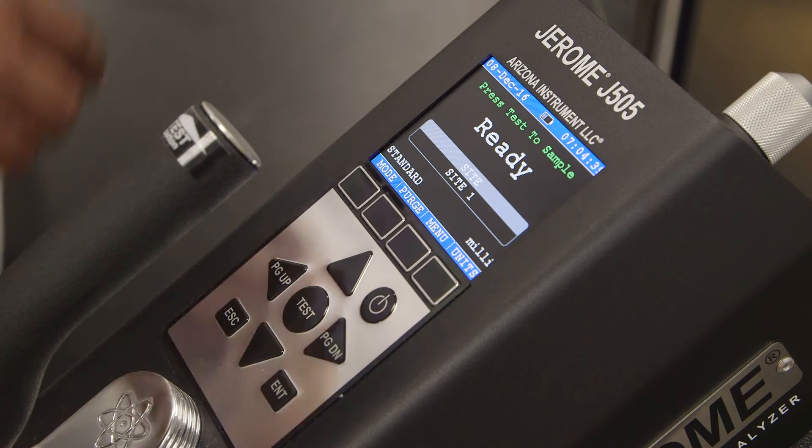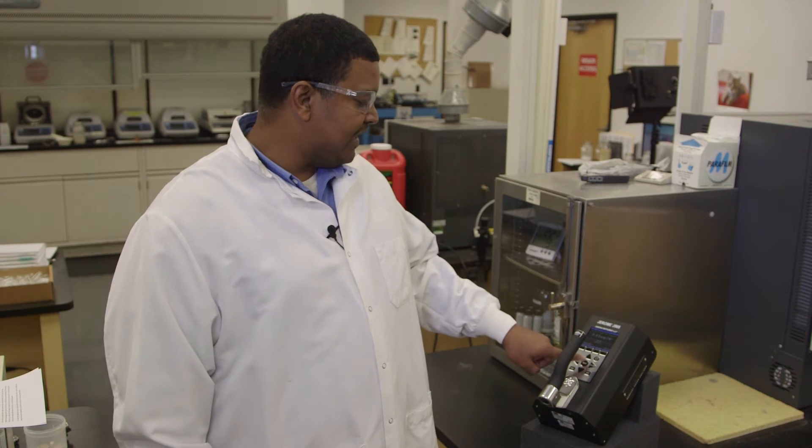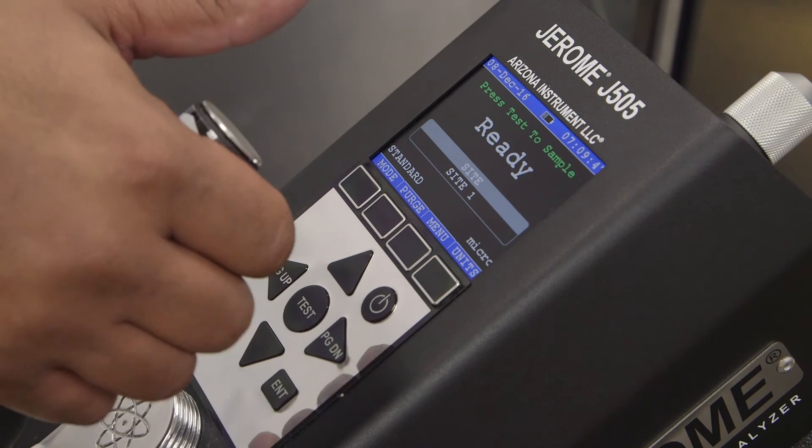Once you've verified that the mode and units are correct, you're ready to take a test. To take a test, simply press the test button in the center of the keypad or in the tip of the handle.